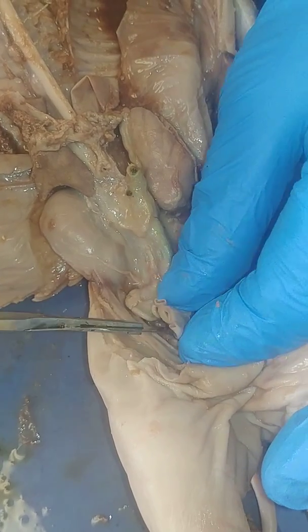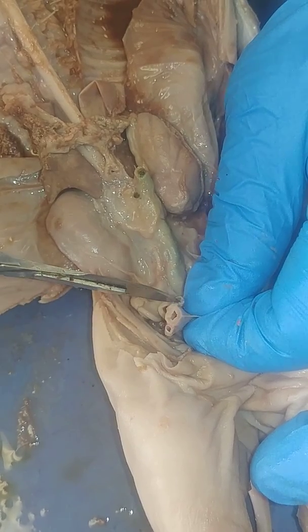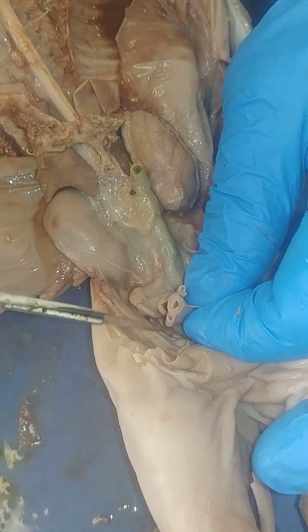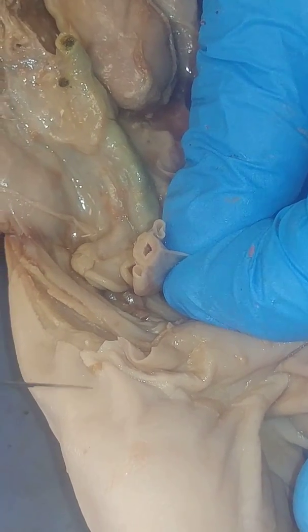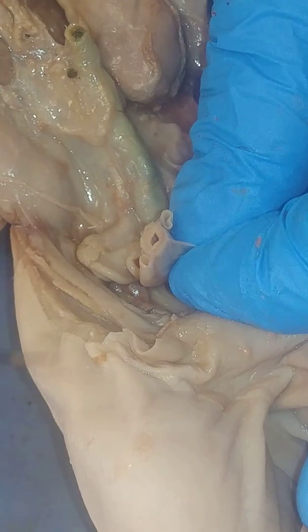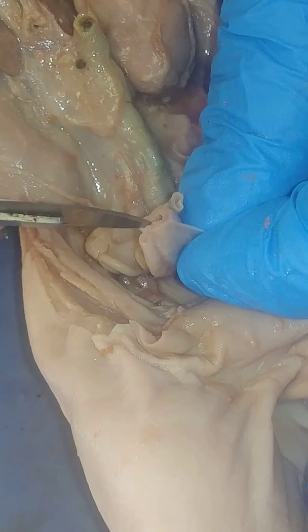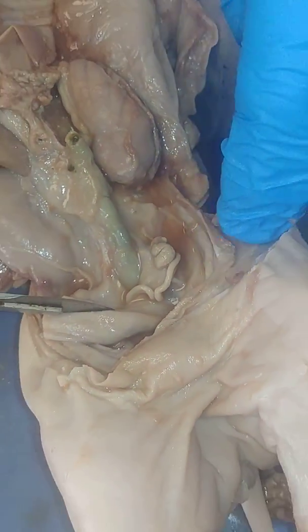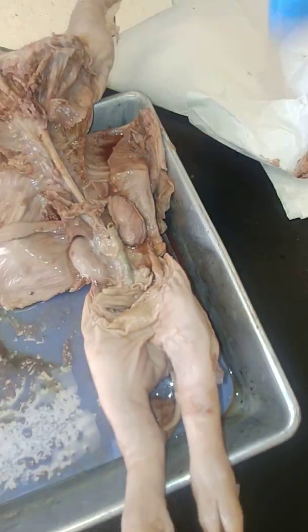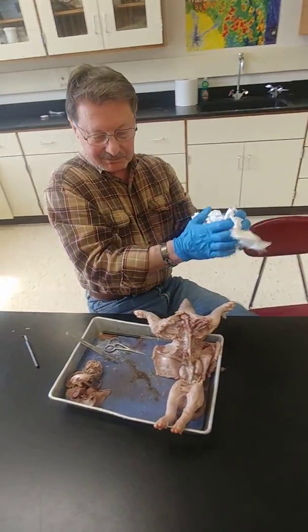And you've got, if we can see here, 3 sets of vessels to be connected there. This seals off after the pig is born. And just like in humans, when they snip the umbilical cord and then it dries up and falls off. You got the same thing that's going to happen with all mammals. And that's going to conclude our dissection of the pig.